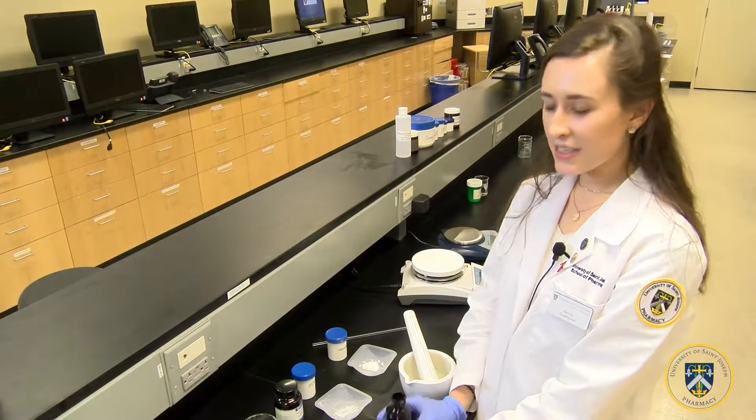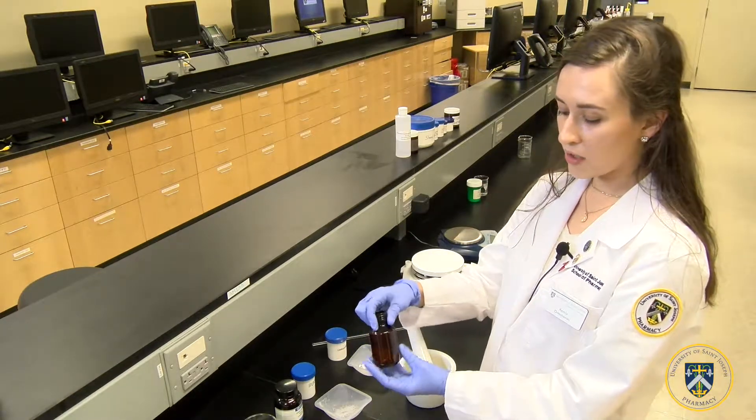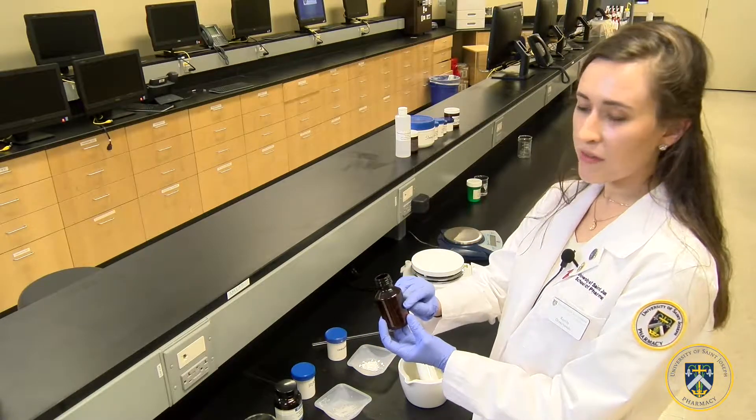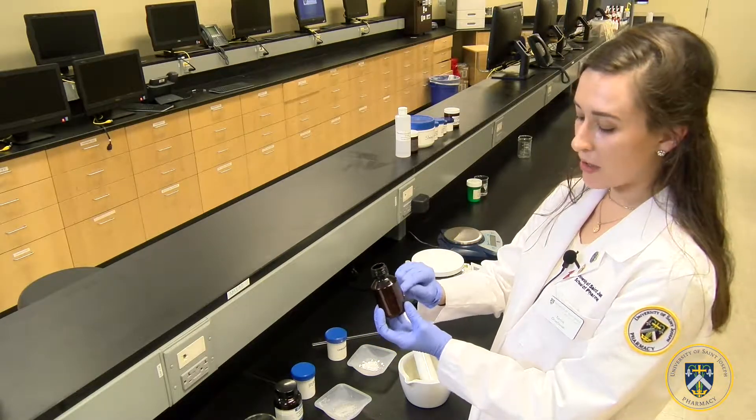We will be making 60 mls of the carisoprodol suspension using an amber vial which has been previously calibrated to 60 mls.